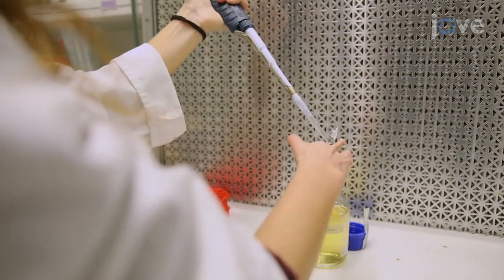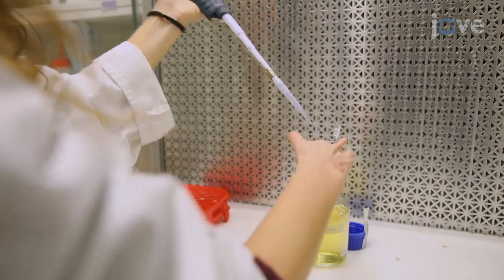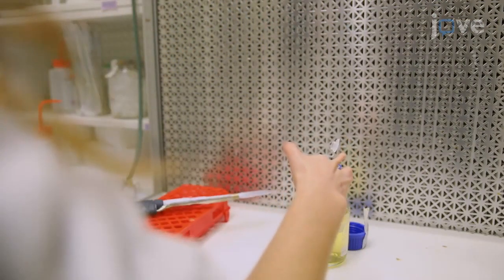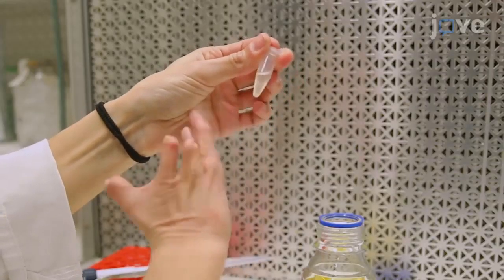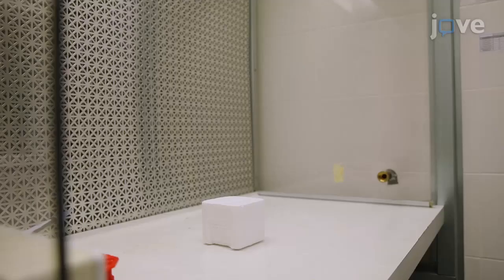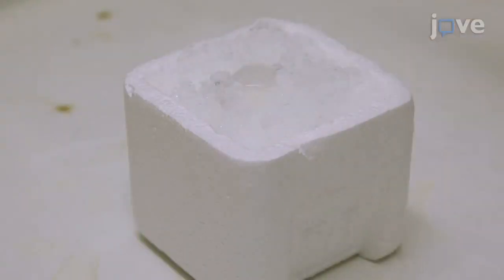After the second wash, resuspend the pellet to the appropriate concentration to obtain a final OD600 of 0.8 and place the bacterial cells on ice.